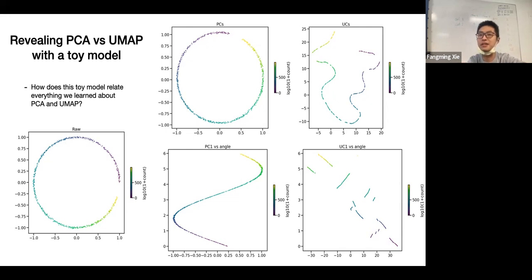So what if we apply PCA to it? That's the result here. It does almost nothing to it because PCA only applies a rotation. It actually does something: it applies the rotation, so it knows the existence of the opening, and has some differences in variance along different axes. So this is the maximum variance. This is the second most variance. But basically, it's just a rotation of this ring, right? And what UMAP does, it completely destroys its shape because it preserves the local neighborhood. All it knows is cells tend to lie along a ring, and it tries to preserve this one-dimensional structure that cells are lying upon, but it doesn't care about the shapes or the wiggles in this. So this is kind of arbitrary in this sense. But it's unfair for UMAP because UMAP is designed to not preserve global structure.